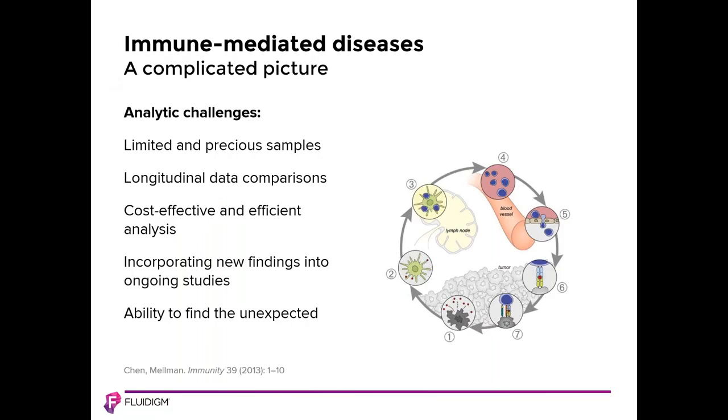Profiling the human immune system is a key application used in translational and clinical research to look for biomarkers of disease or response to therapy. It is essential in driving the search for more effective treatments for almost any disease, including cancer, autoimmune diseases, or infectious disease.